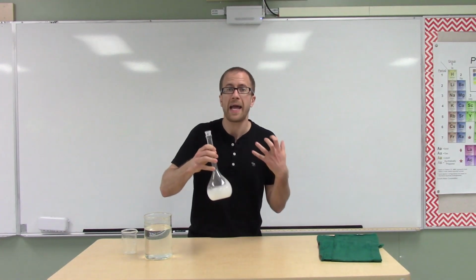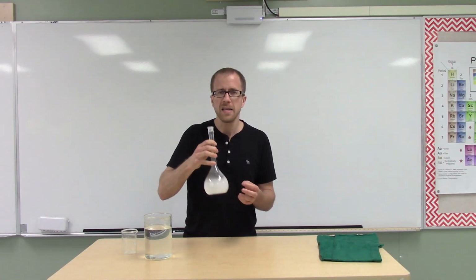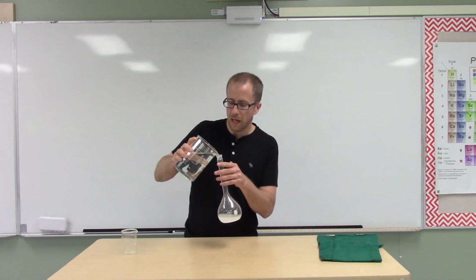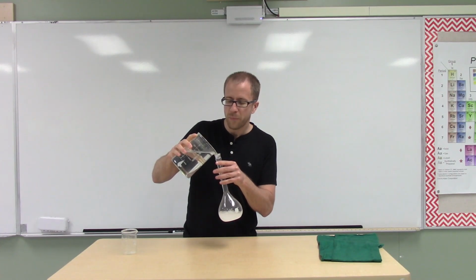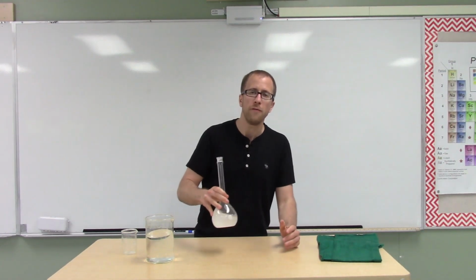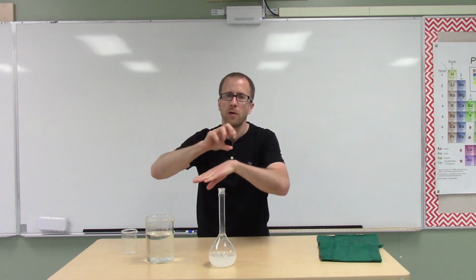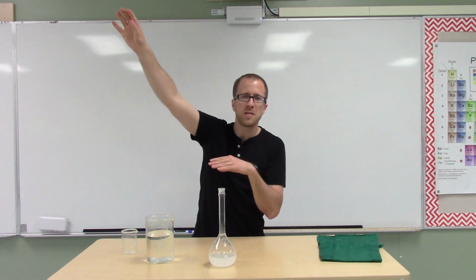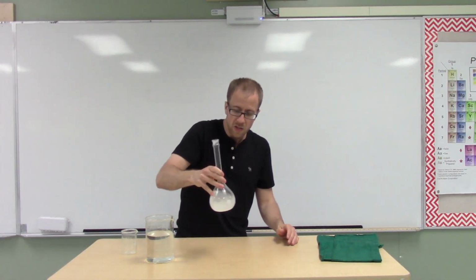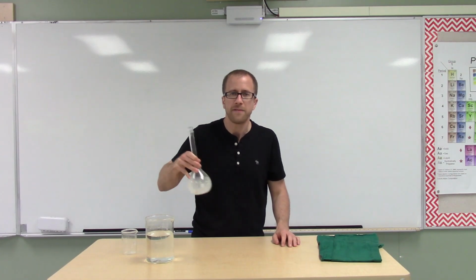By stirring, by agitating, what am I doing? Why is it that it'll dissolve faster when I agitate it? Well, that's because I am allowing fresh solvent to come into contact with our sodium chloride. But if we were just to let it sit on the counter, you would have to wait for that saturated sodium chloride solution to leave and diffuse out from the interface where the solid salt is interacting with the water. So, by swirling it up, we are increasing the rate of dissolution.